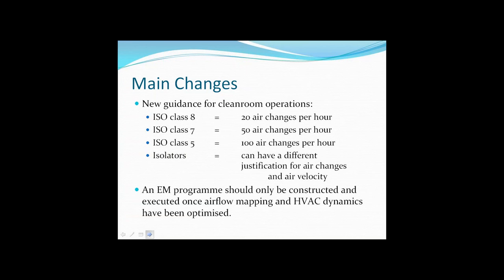And this is because really the results of the airflow visualization should be helping with the decision as to where the environmental monitoring locations are placed. And the only way to really get a good feel within the aseptic core of where the best place to put a settle plate or an air sampler is through smoke study visualization.